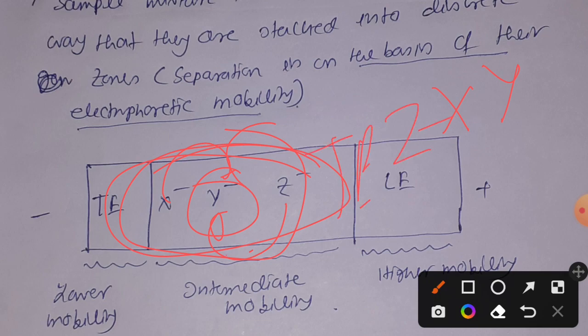That is how the separation will go on up to a certain time. After that there will be an equilibrium point after which there will be no rearrangement, right? That means they will move at the same speed in the same arrangement, right?